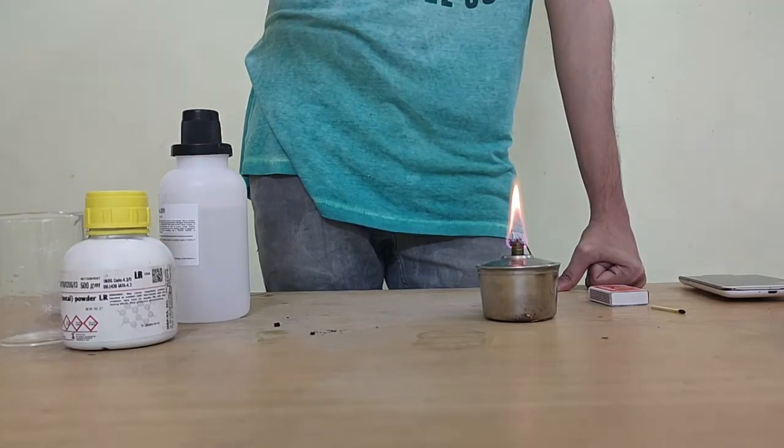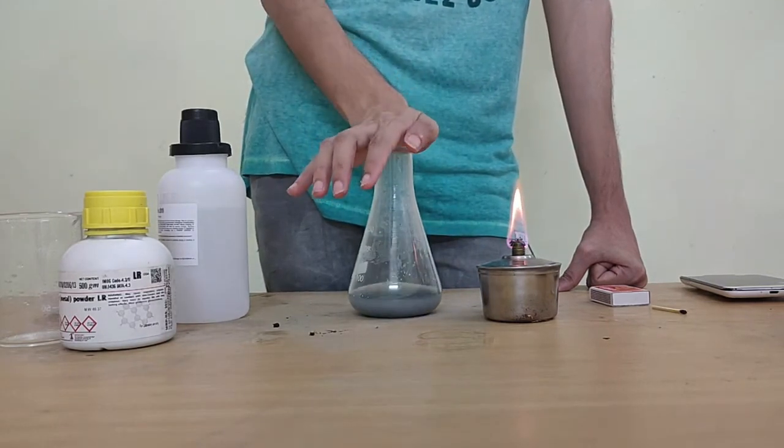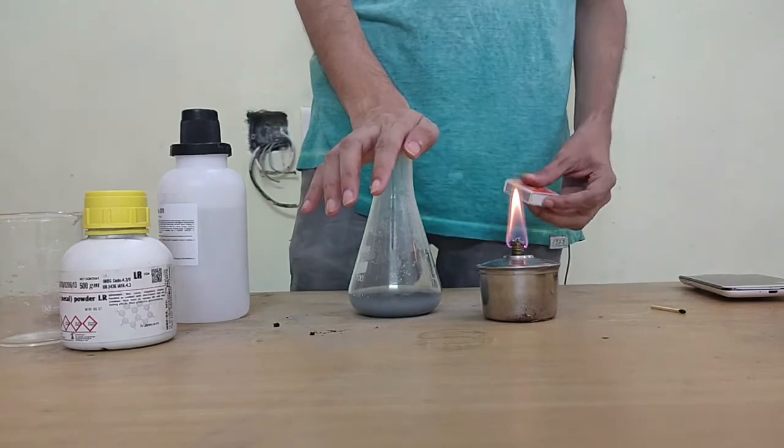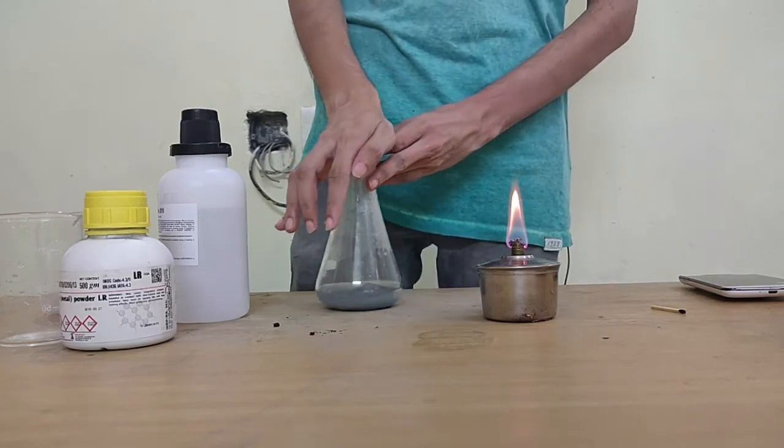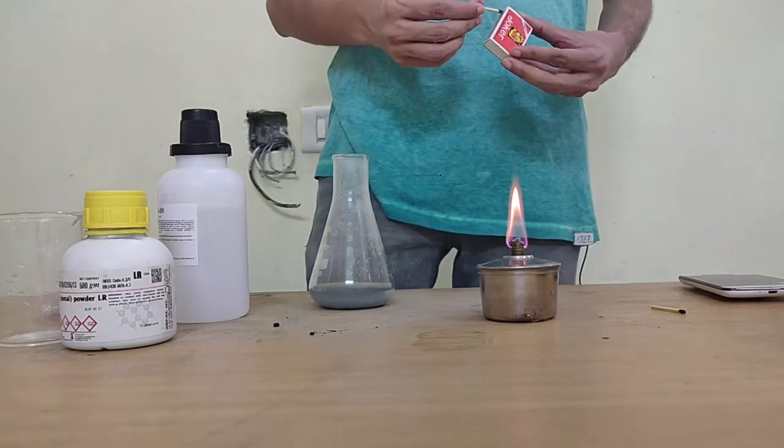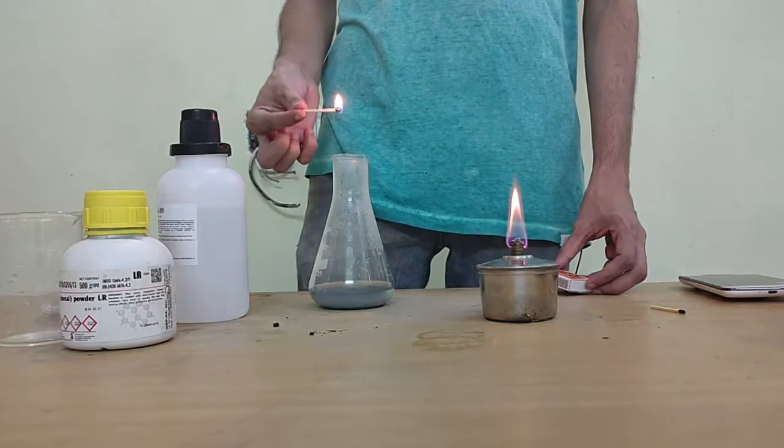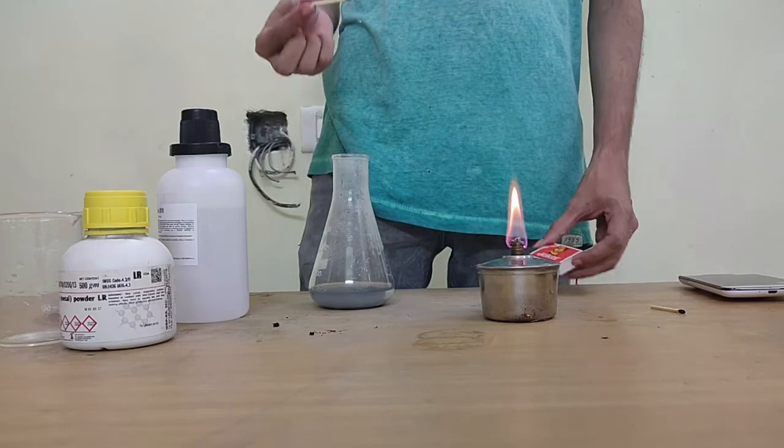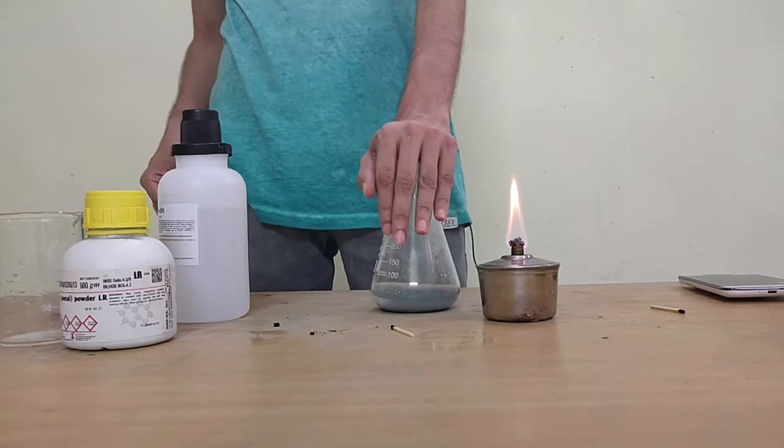I think the reaction is kind of occurring so I will try to test it now. I'm going to close this beaker mouth for a while, make sure the gas is collecting within, and just stay away from the flame. Let me light a match. We're going to perform the same test. It did go off, not with the pop but yeah it did go off. It just needs to collect for a bit longer as far as I know.